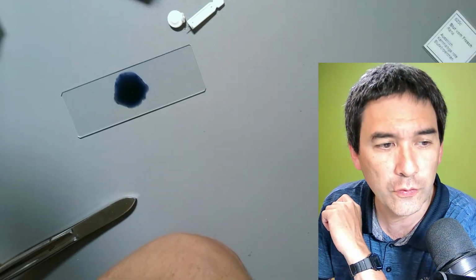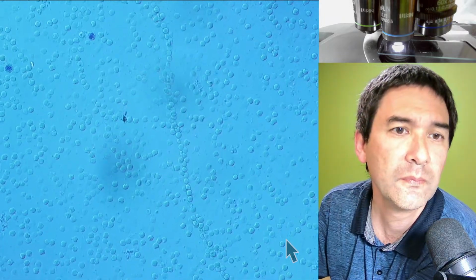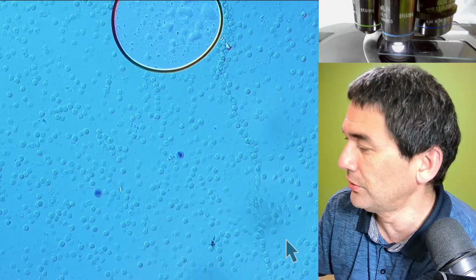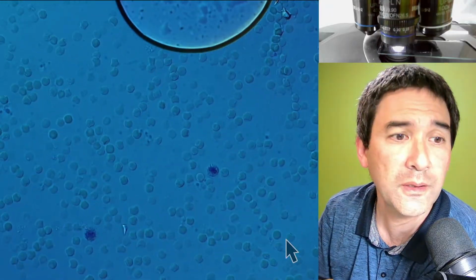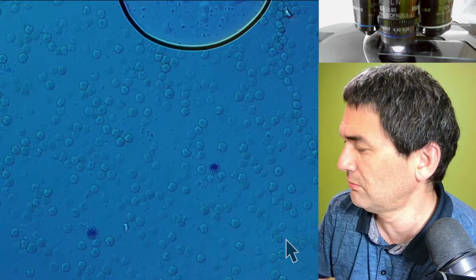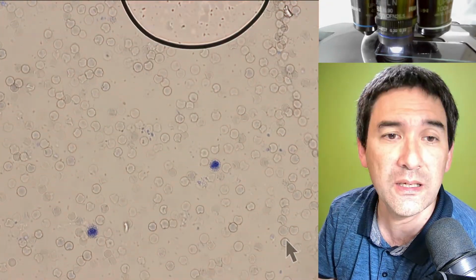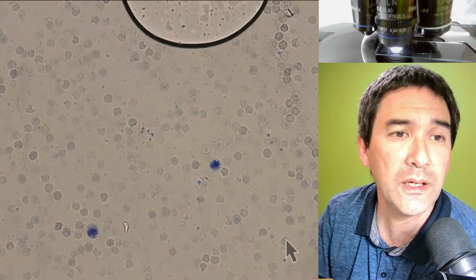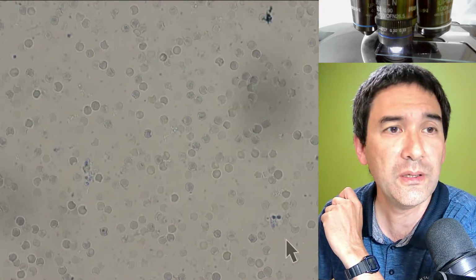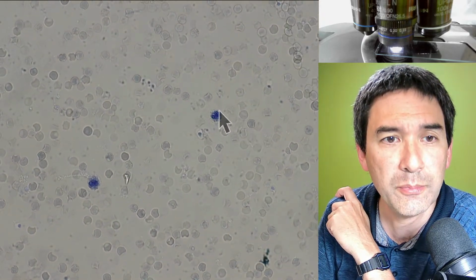Oh yeah, I have to change over to the scope view here. I think that might be better. Okay, so yes, beautiful. I'm going to move up to 60 times. And you know what? I'm just going to put the filter away. Yeah, here we go. This is now basically bright field, and we can already see that some cells, like the ones over here, are stained blue.